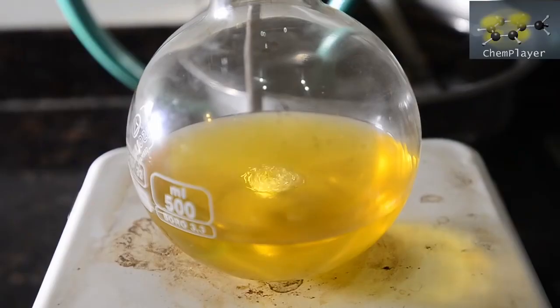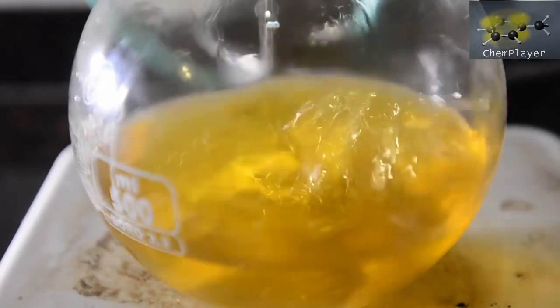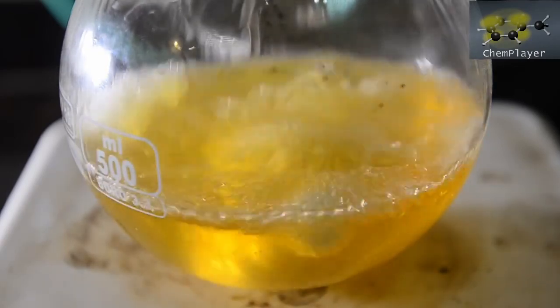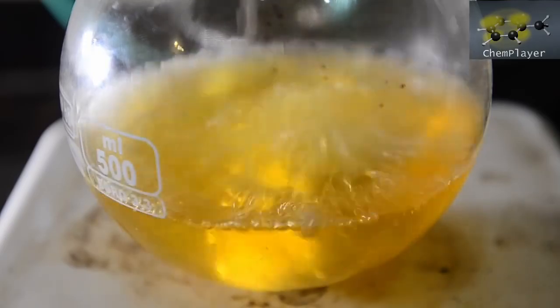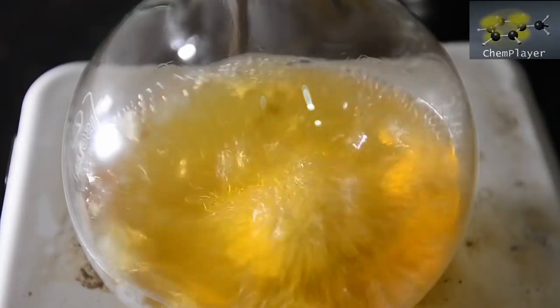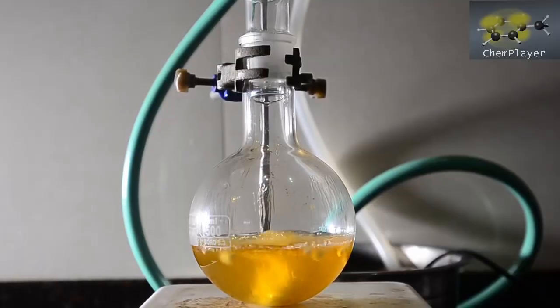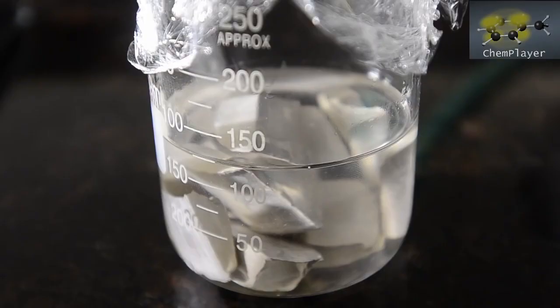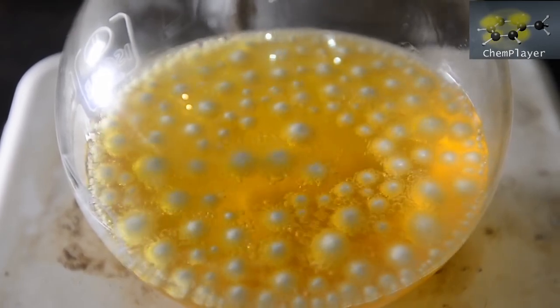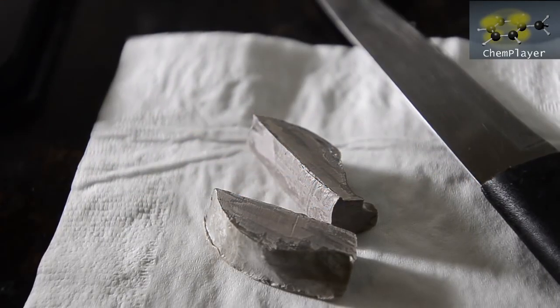After about 5 minutes the reaction dies down again. Time to add some more sodium metal. Again there's a vigorous reaction. Not quite as vigorous as the first one though. We let this react and die down again, which takes slightly longer. Still got a lot of sodium to go. The molten sodium balls really are very pretty. We wonder what would happen if the flask broke right now. But there's only one way forward.